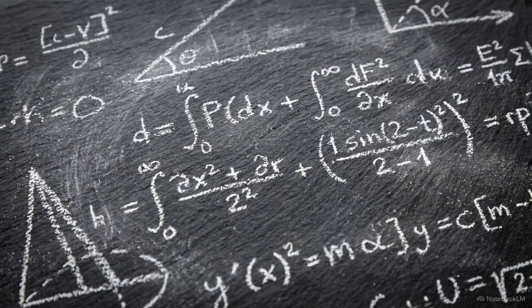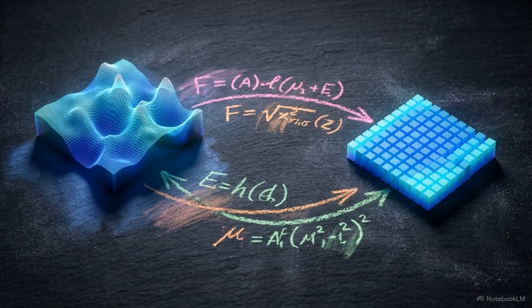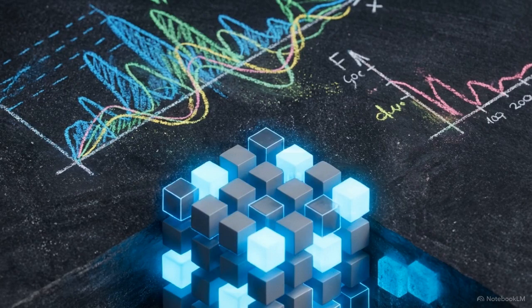DWT. The DWT is a mathematical tool that decomposes a signal into mutually orthogonal sets of wavelets to capture both frequency and location information simultaneously. The discrete wavelet transform functions as a data reduction technique, distilling the raw signal into its most essential components.